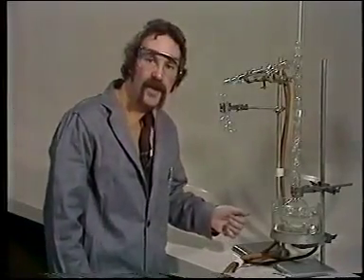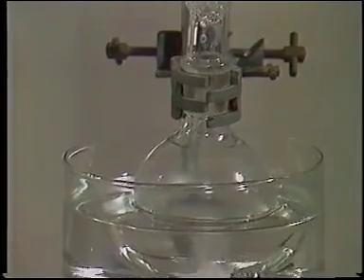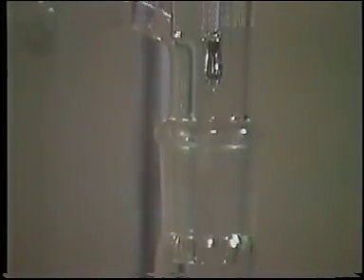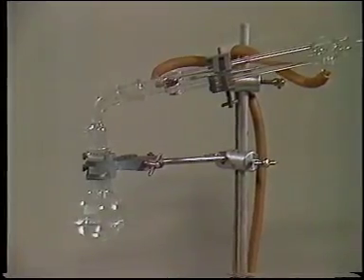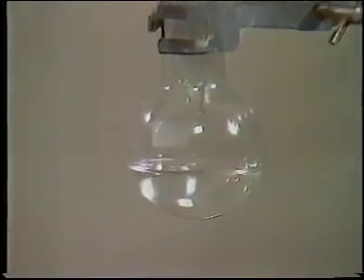This distillation flask contains a mixture of organic liquids, and the fractionating column is packed with glass beads. As the vapours ascend, they condense and trickle back, but further hot vapour rising up the column causes them to be redistilled. This goes on several times until, at the top of the column, vapour from the pure, low boiling fraction distills over, is condensed and collected.